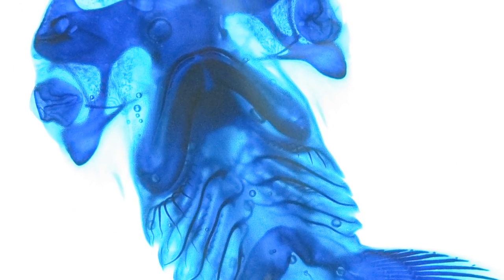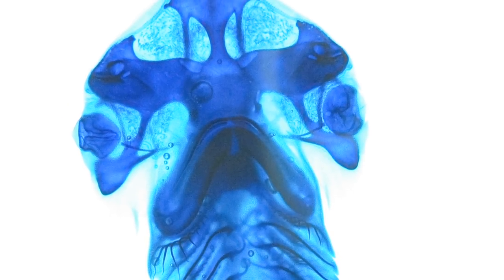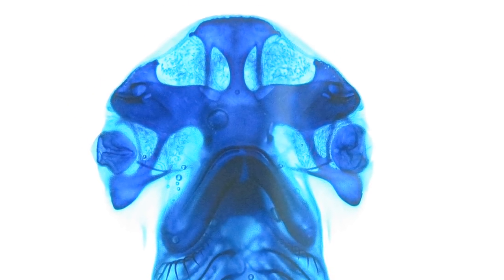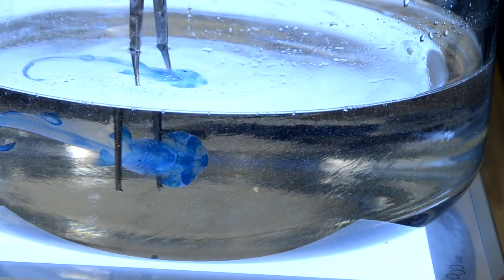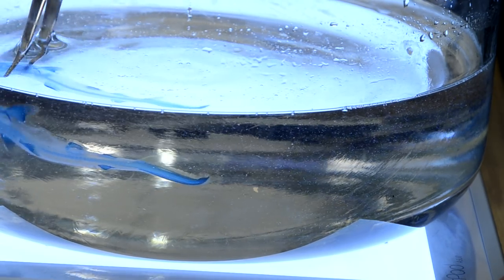But when we were looking at this head, especially in the cleared and stained animal when you circle it around in the glycerin, you don't really see the head tilting. The head kind of tracks really nicely flat.